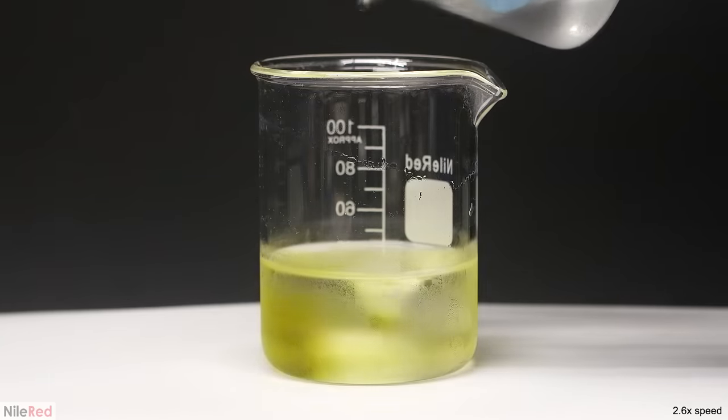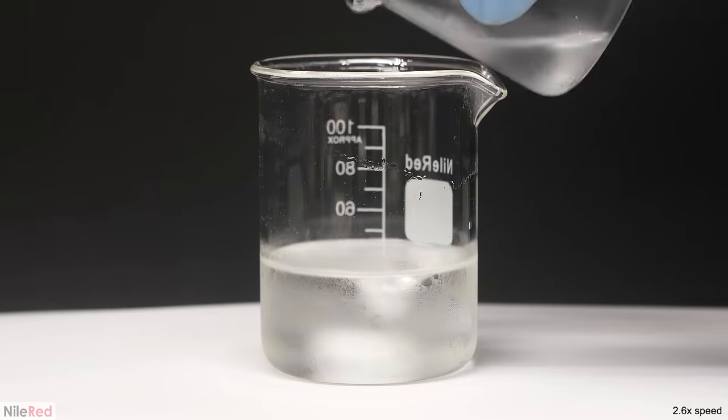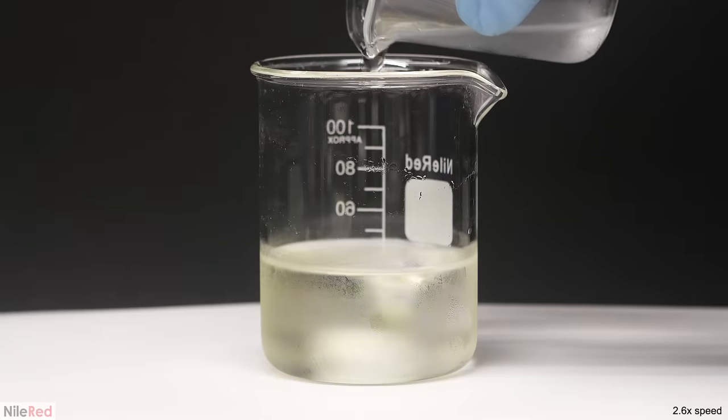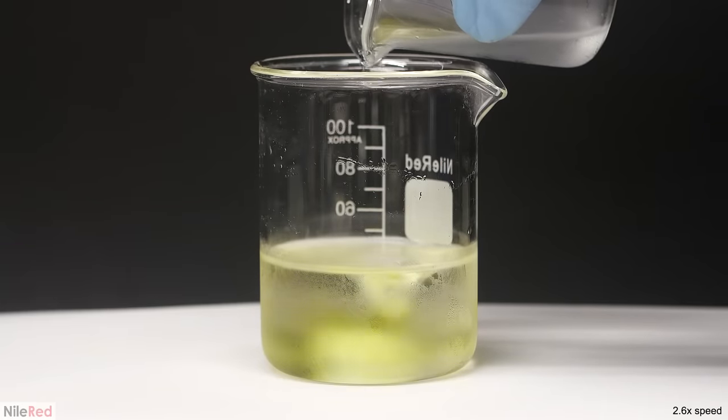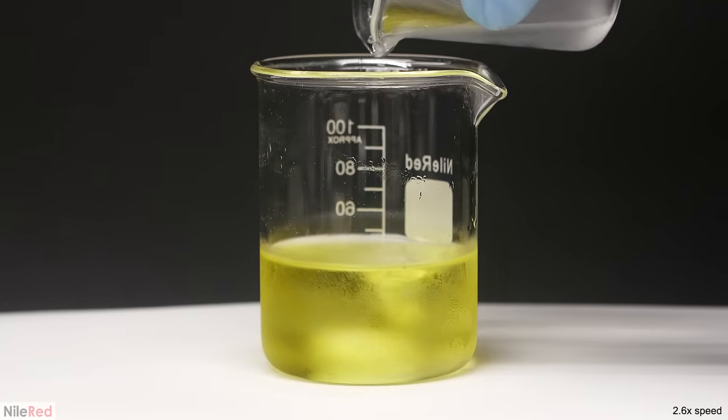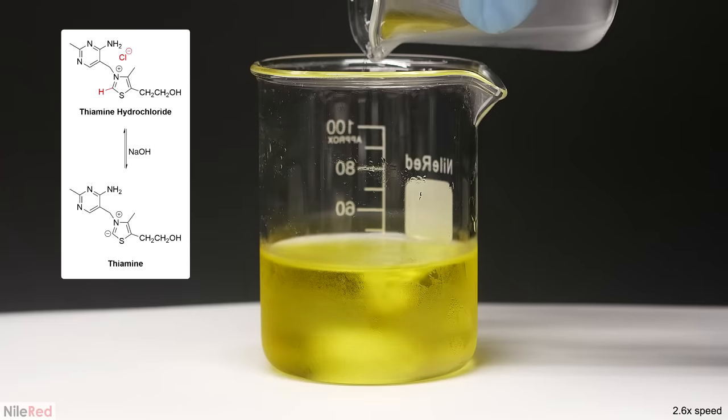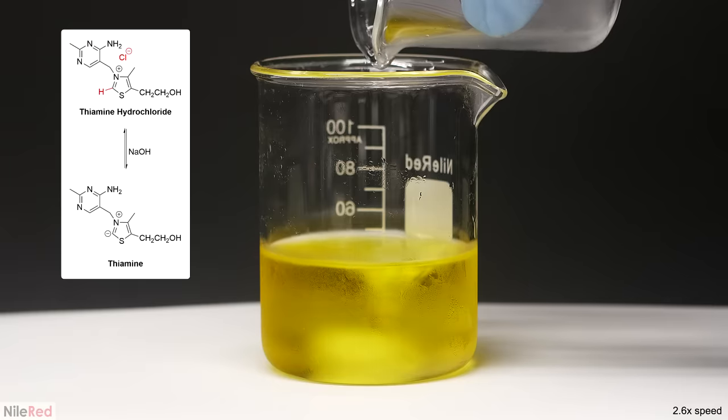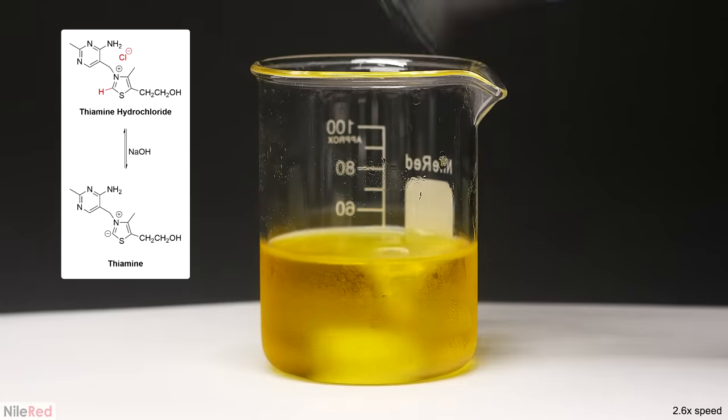Both solutions were put in the freezer, and I took them out when they were around 0°C. With good stirring, the base solution was slowly added to the thiamine hydrochloride, and a yellow color started to appear. The reaction going on here was between the sodium hydroxide and the thiamine hydrochloride to make just thiamine, which was the active catalyst.